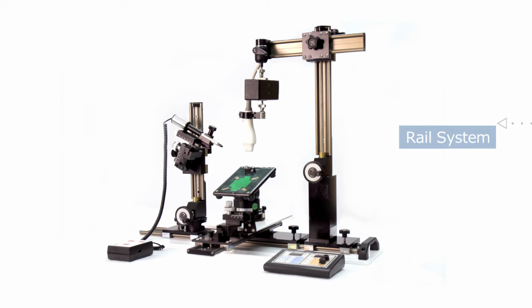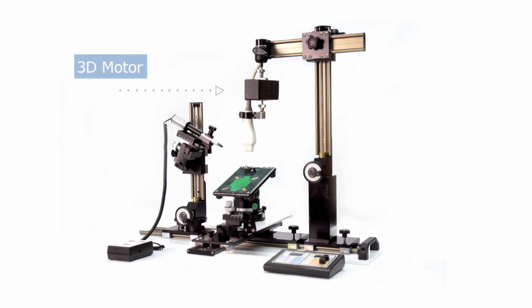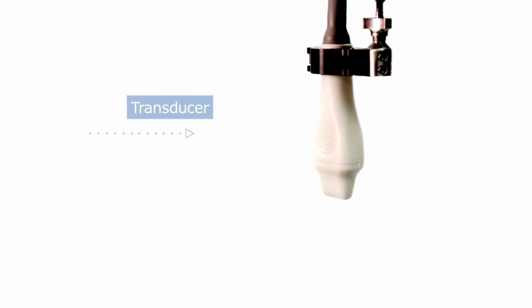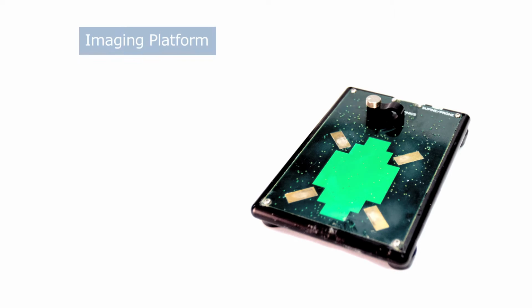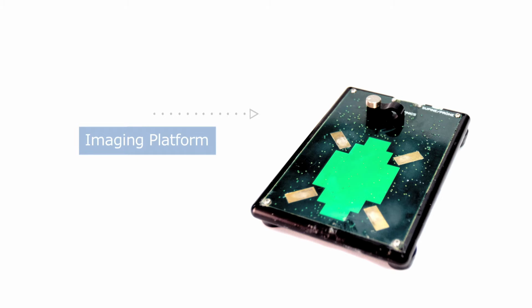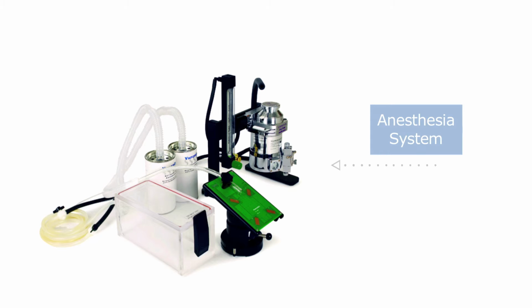It houses the intricate rail system, 3D motor, linear array transducer, micro-injection system, physiological monitoring system, and integrated anesthesia for superior animal handling and study reproducibility.